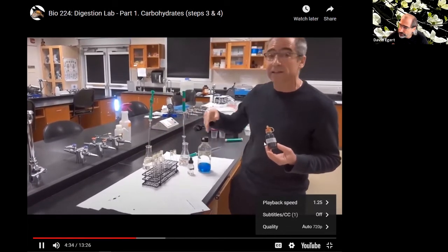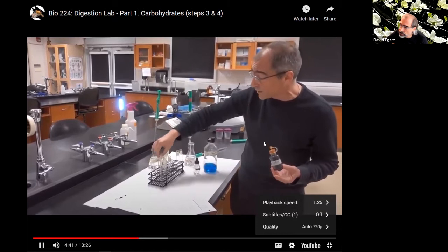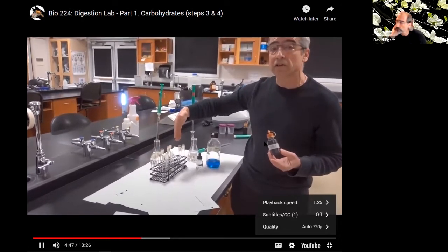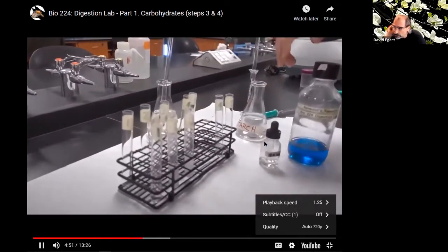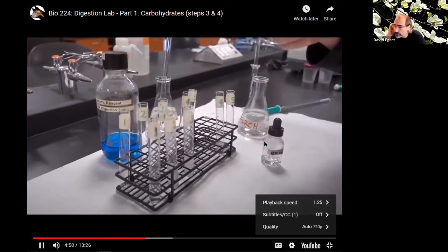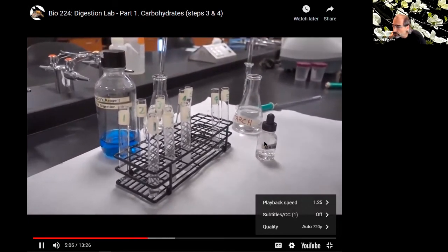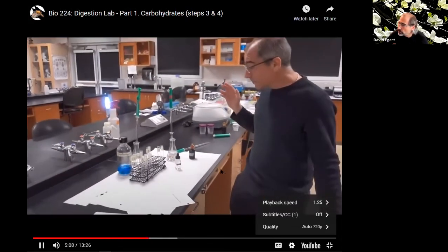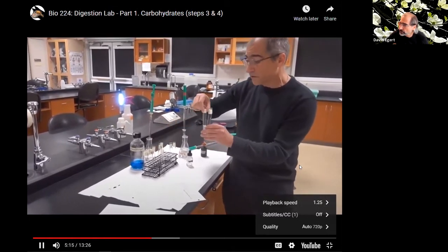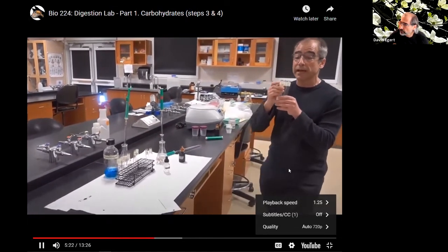So we're going to be putting these in the incubator. And after we're done, we need to make sure we take each of these tubes and split it into 2 tubes. That way we can do the Lugol's test to look for starch in one set, and we can use the Benedict's test on the other side to test for the presence of maltose. If you forget to do this and put your Lugol's iodine in here without having split it ahead of time, then you're not going to be able to do the test for maltose. So at this point, we're going to incubate them at body temperature, and we'll come back in a while and see what happens.